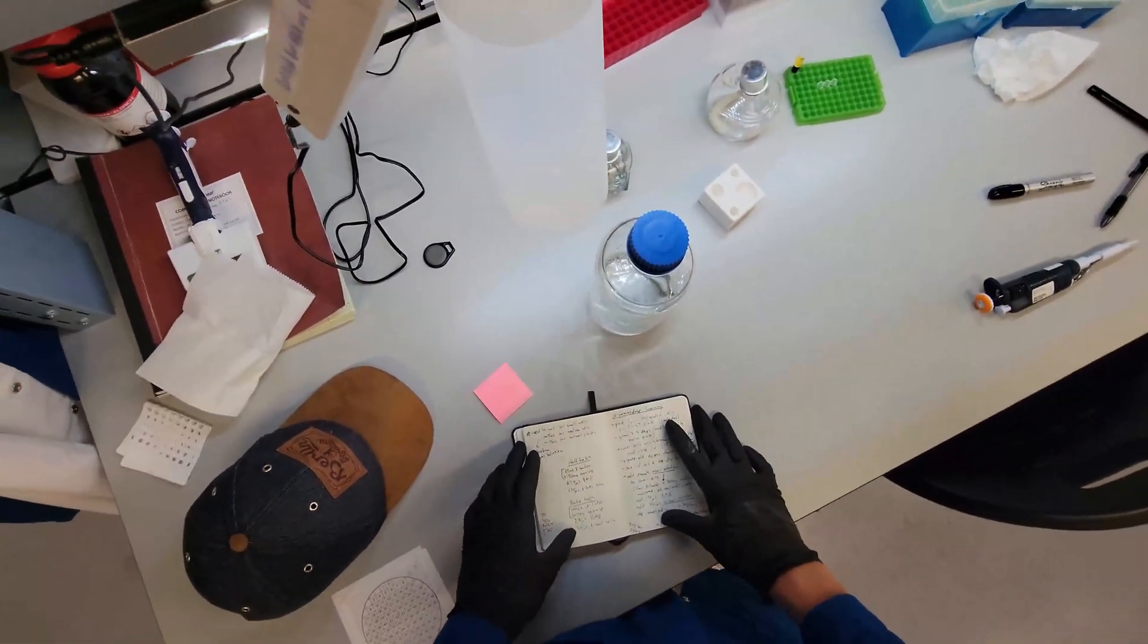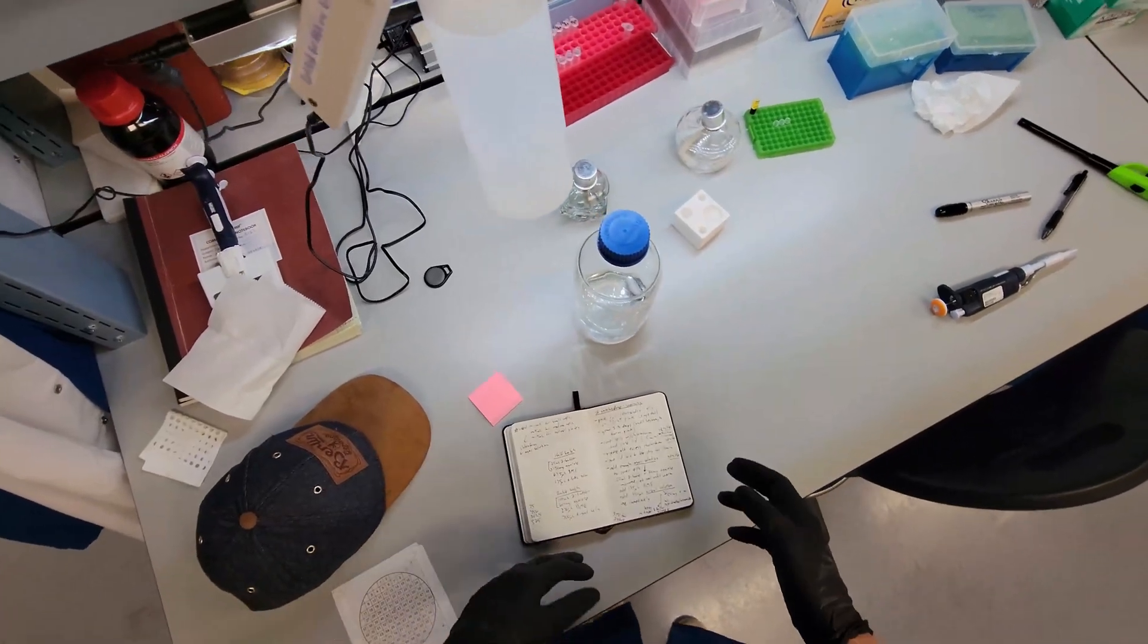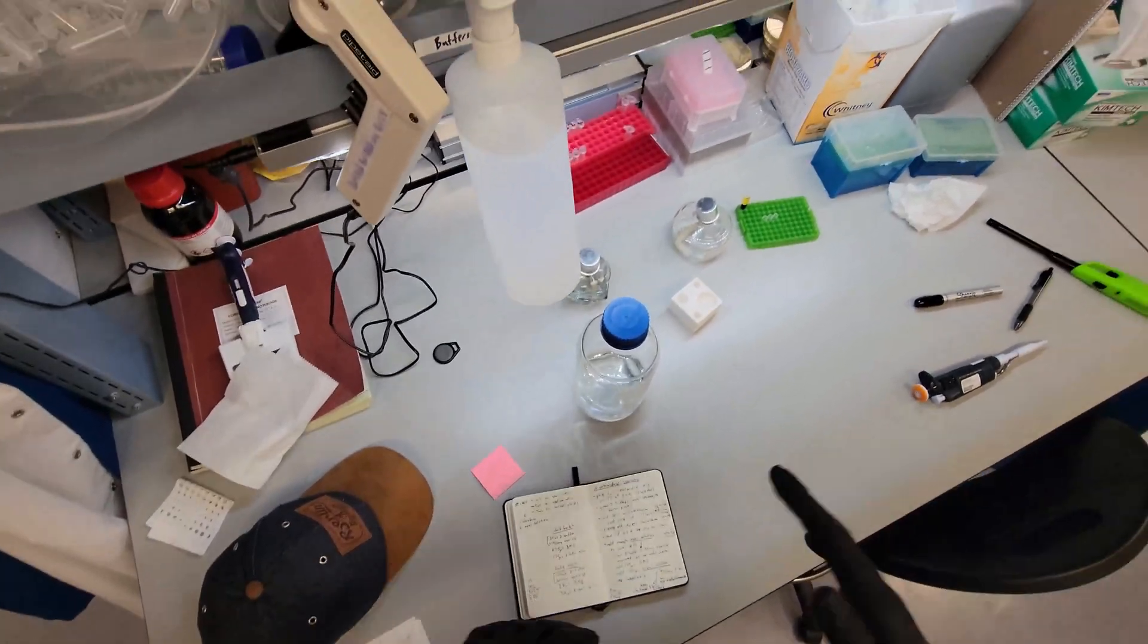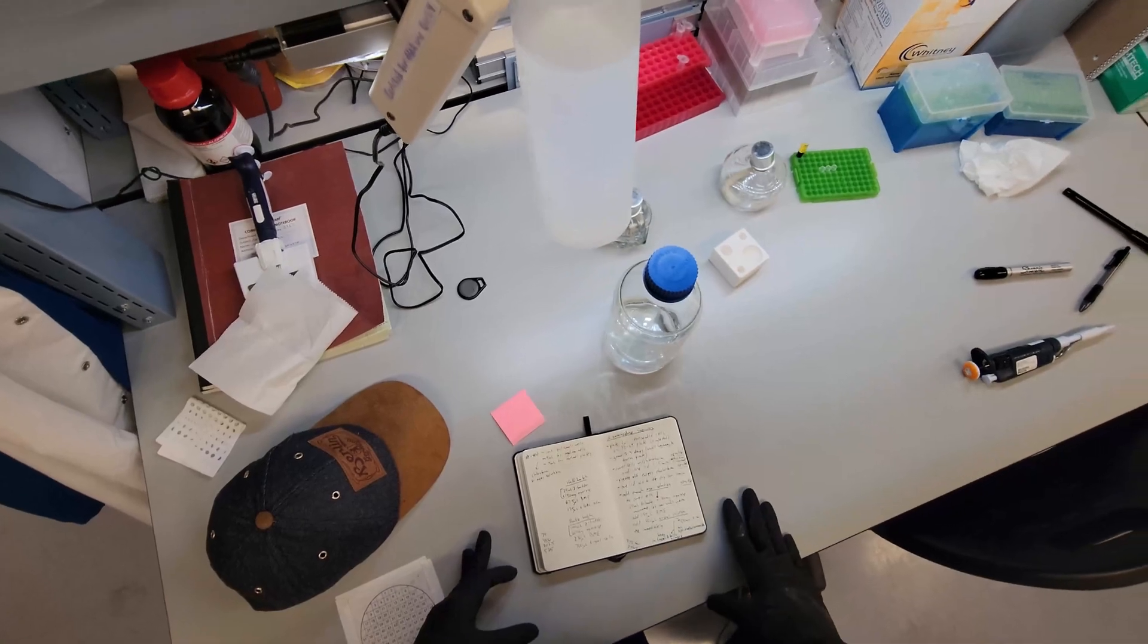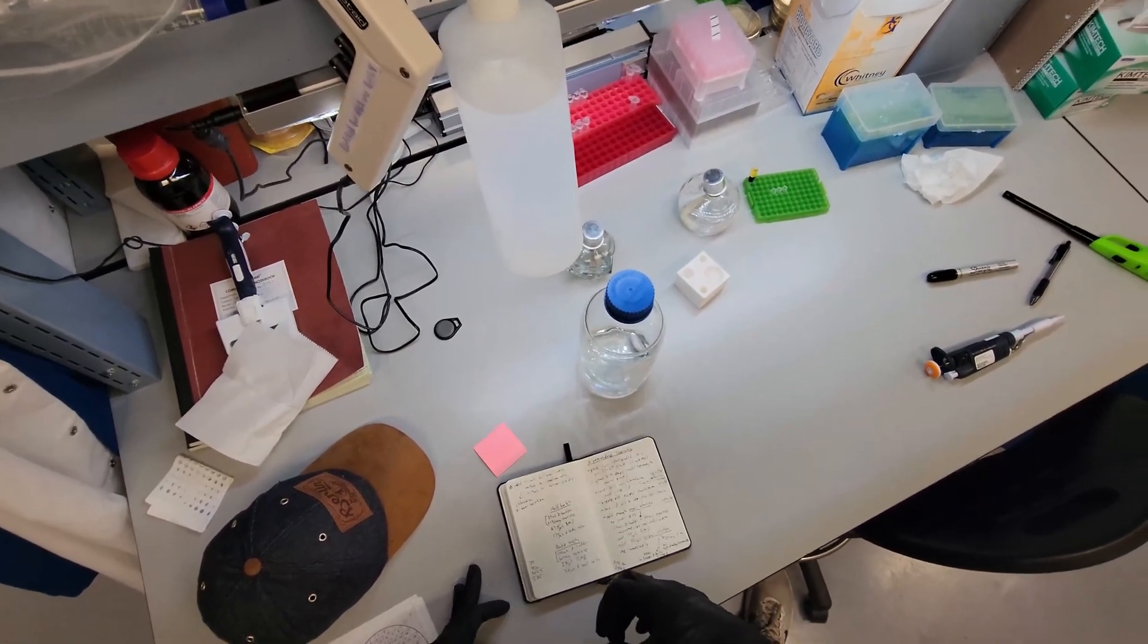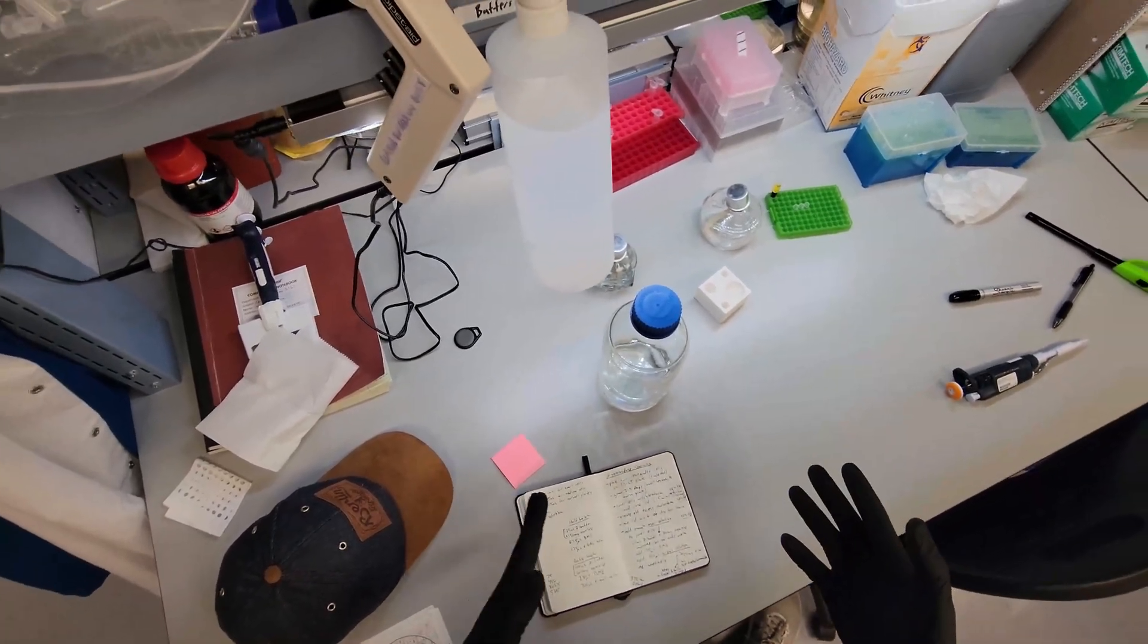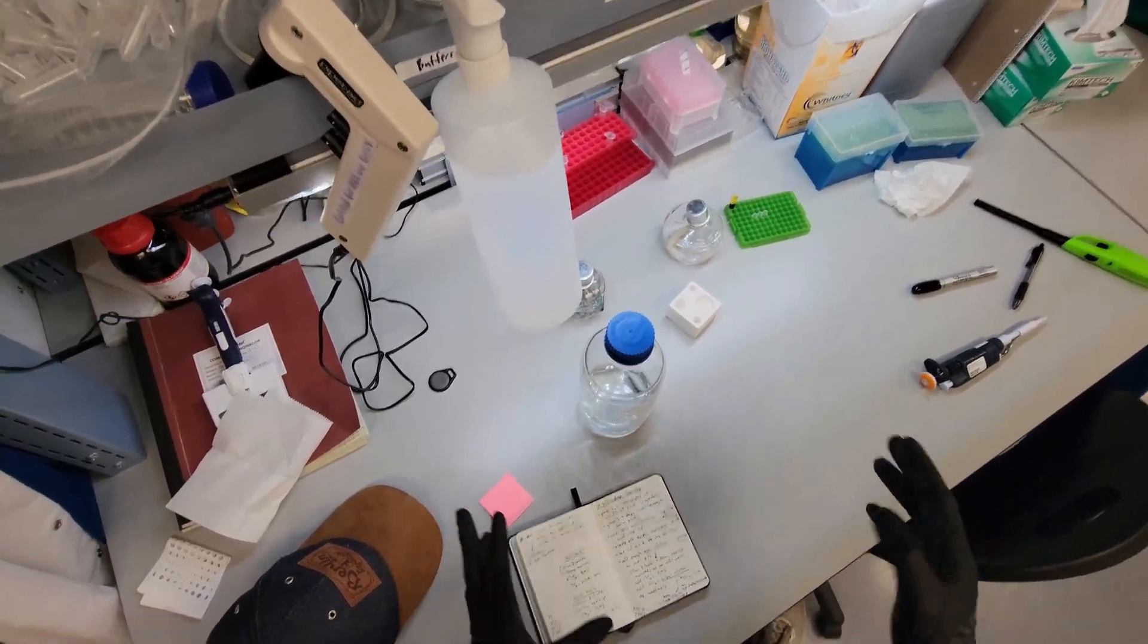My awful handwriting. But basically the idea here is that we want to use chloroform to bust open these cells and stain them. If they are expressing the beta-galactosidase gene, then they'll cleave a chemical that we add called X-gal, and the cells will turn blue. If they're not expressing the gene that we want, then the cells will stay white, or in this case a little bit pink.